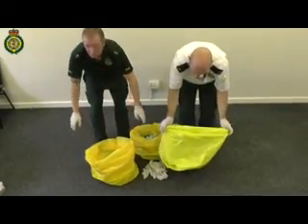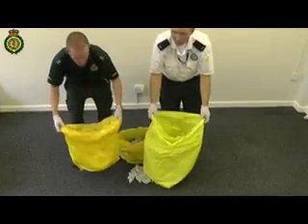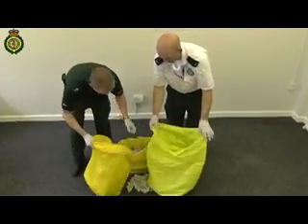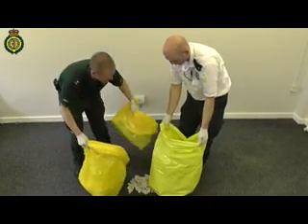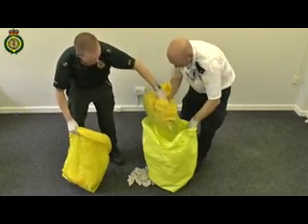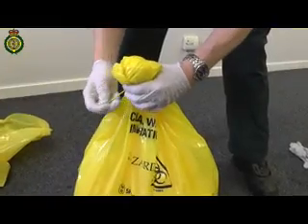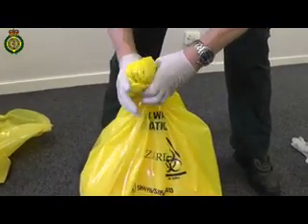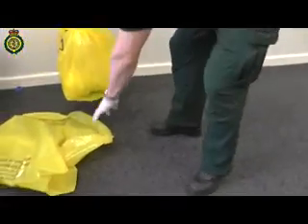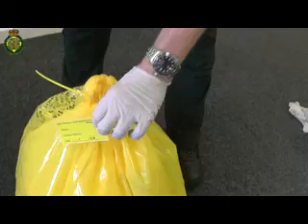Make sure all the waste is inside the bag. Roll the bag up. Dispose of the middle bag by putting it inside one of the other bags. And then change your gloves again to bag up all three. With clean gloves, seal and tag the bags and put everything into your spare sixth bag. Tag and label this bag as contaminated and highly infectious waste.